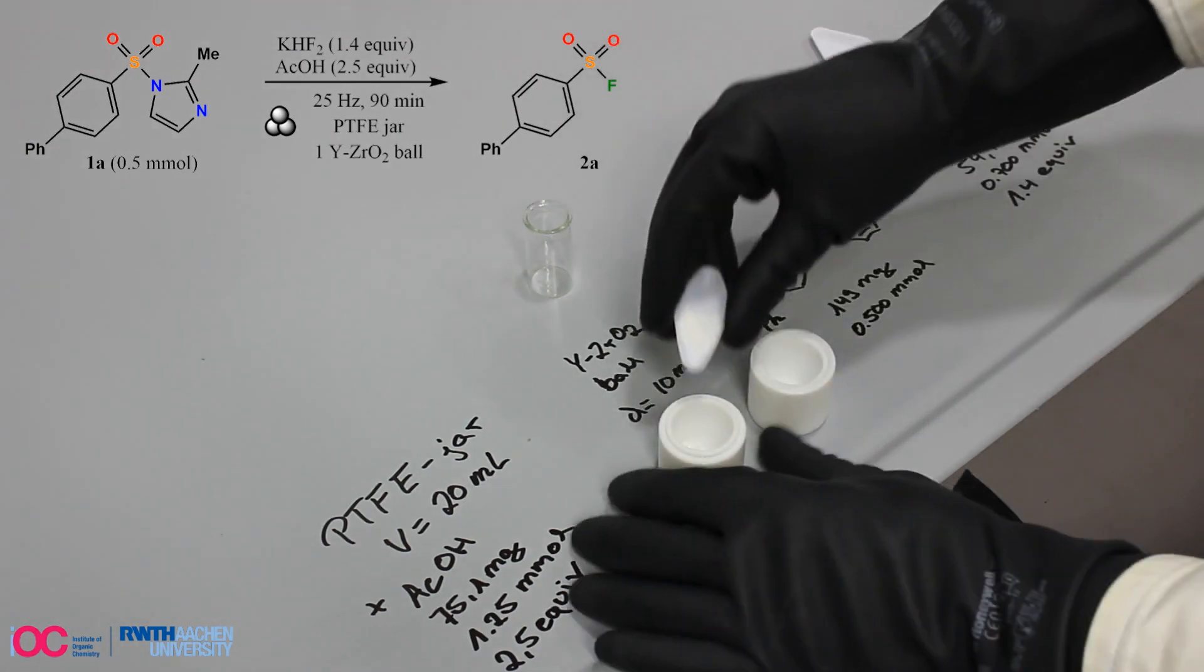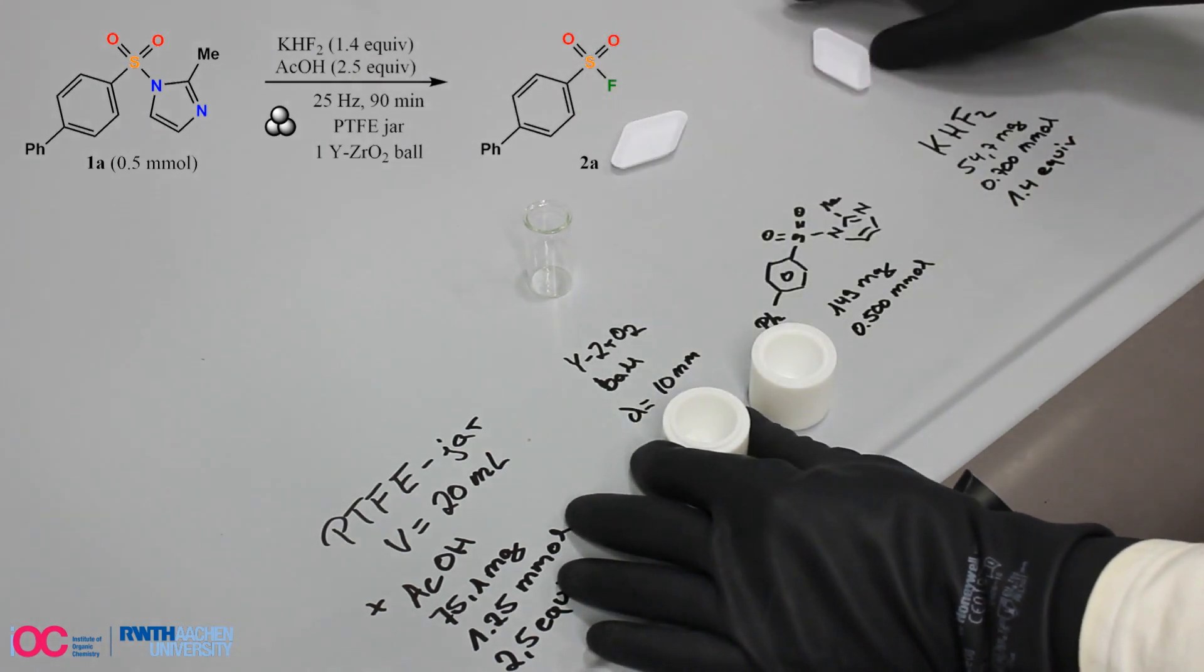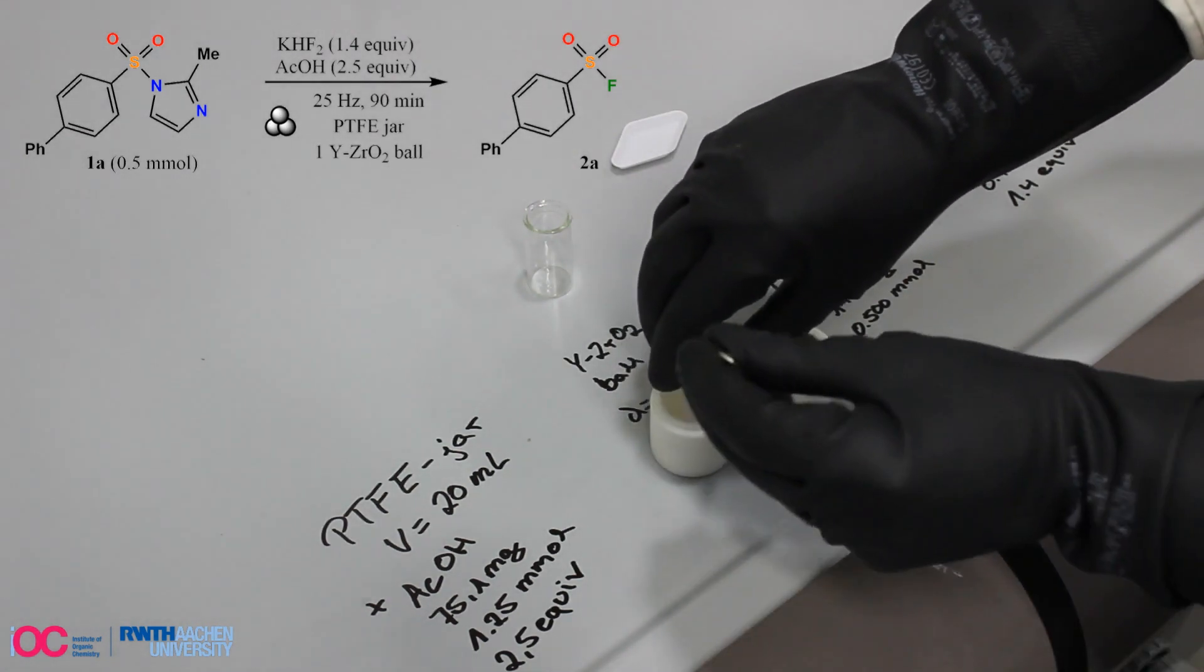The acid is already loaded in a PTFE milling jar. Then a yttrium-stabilized zirconia milling ball is added and used to distribute the liquid acid on the surface of the milling equipment.